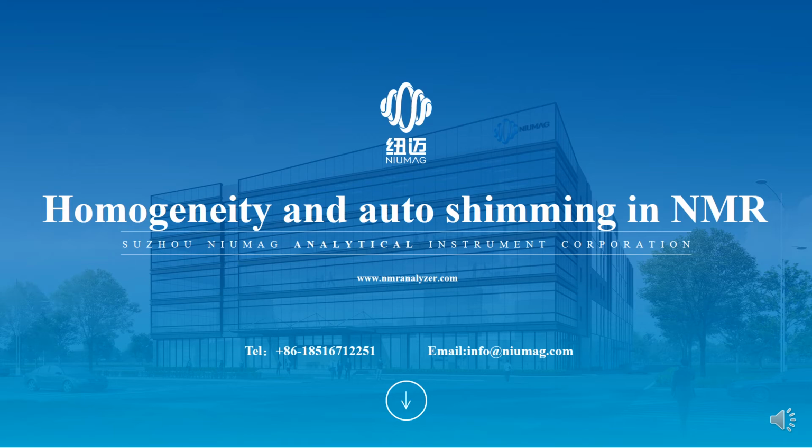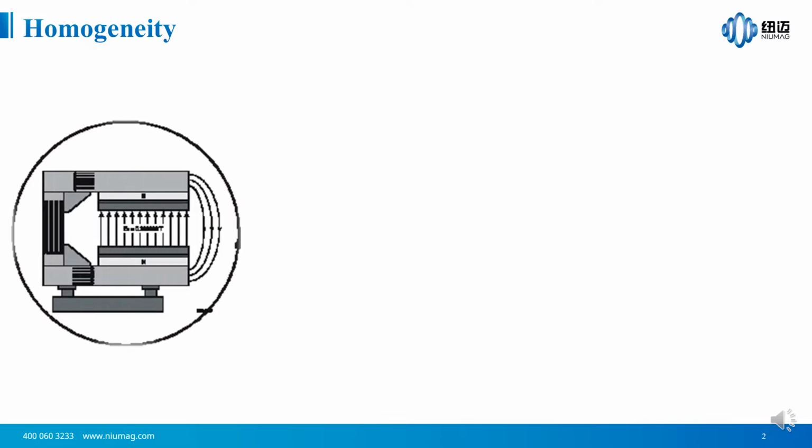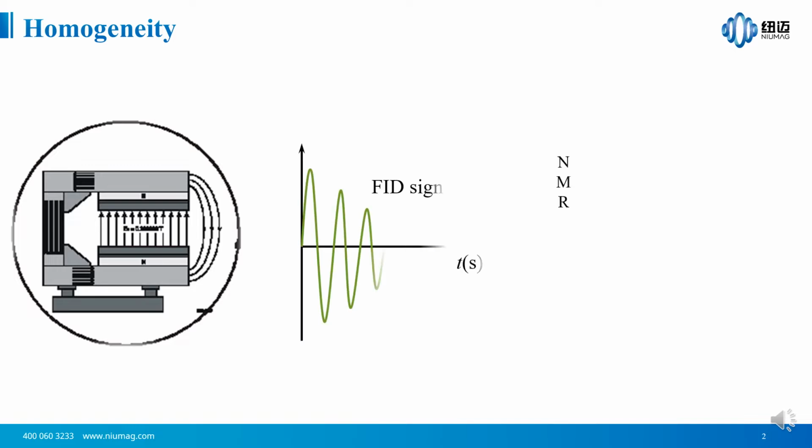Hello everyone. In today's class, I will introduce the definition of homogeneity and the demonstration of auto shimming in NMR. First, I would like to introduce magnetic field homogeneity of NMR.